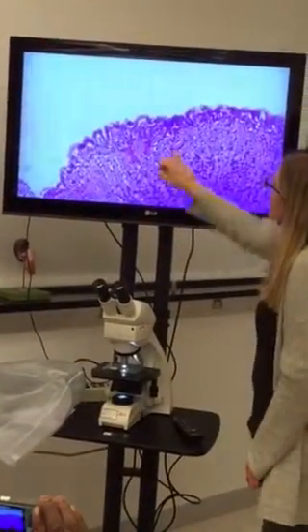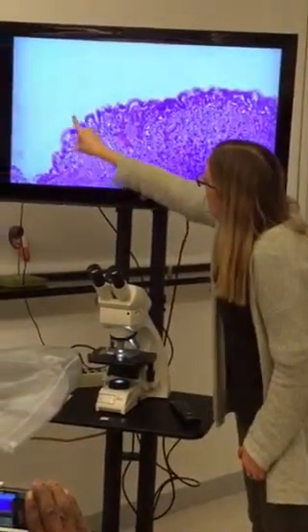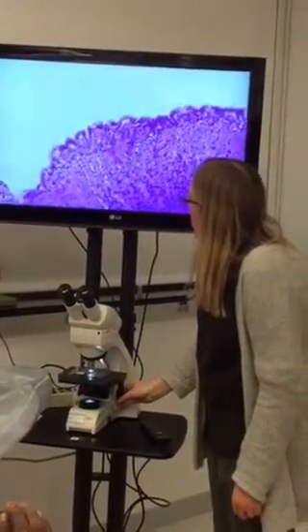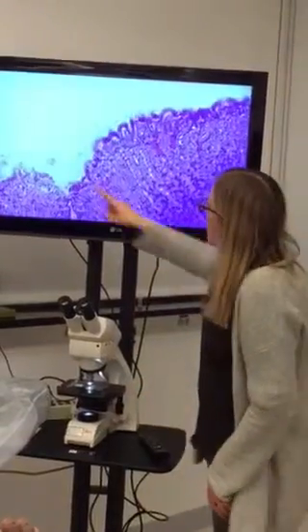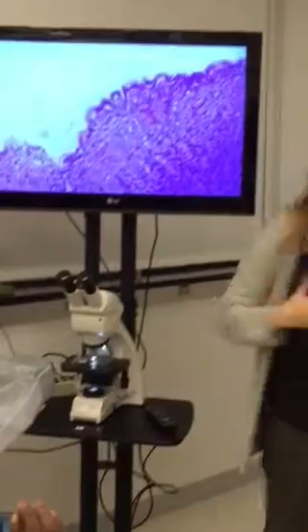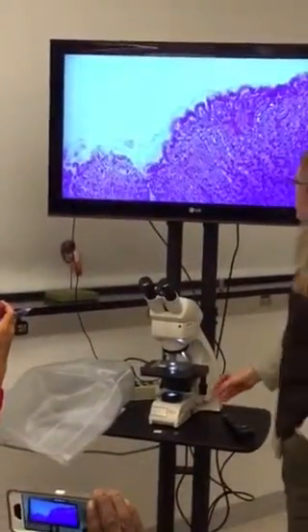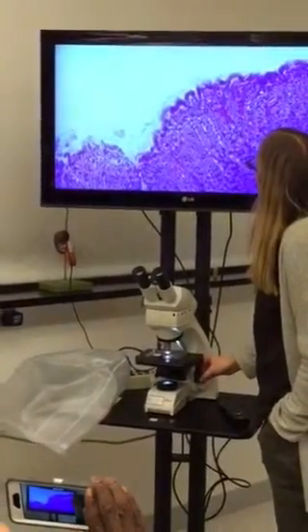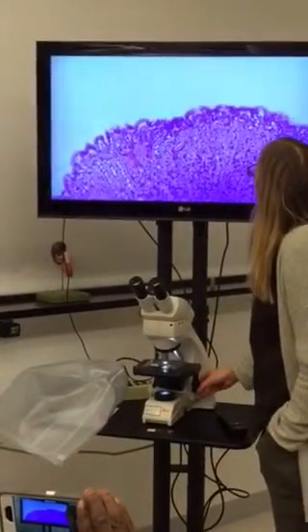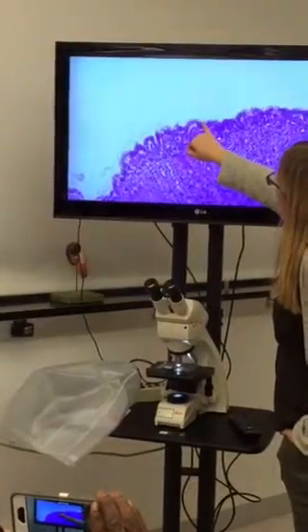There are lots of little white spaces, the goblet cells, releasing mucus, and all this kind of light area out here, so that is a lining of mucus. So where's the goblet again? So this white space, it's kind of going in and out, but this white space is the mucus lining that's coming from the mucus glands, some of which are goblet cells. You kind of have to scroll around to see some. So like in this area, there's some goblet cells.